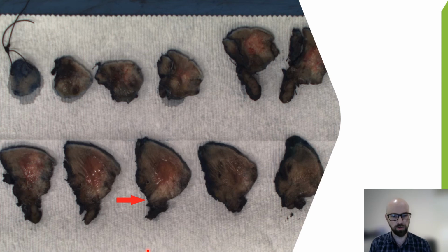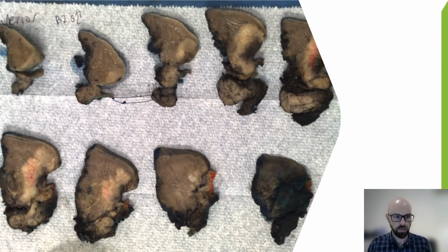It is important to note though, particularly around the border of the tongue and getting towards the floor of mouth, sometimes there is a neck dissection section which is taken from that region and it's just sent in a separate pot. So if you do have a margin around there, it may not be a true margin. So it can be really helpful for pathologists having a bit of neck dissection attached to the main tumour specimen. So we can see that here, we've got the tongue with tumour, and then we've got submandibular gland and level 1B. And so that really helps with the margin assessment, having that little bit of neck dissection attached there.